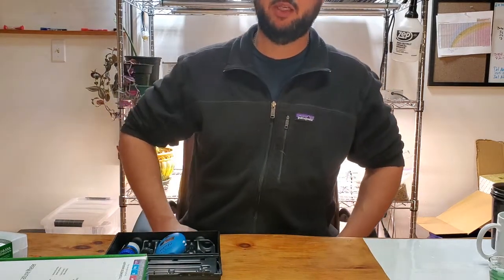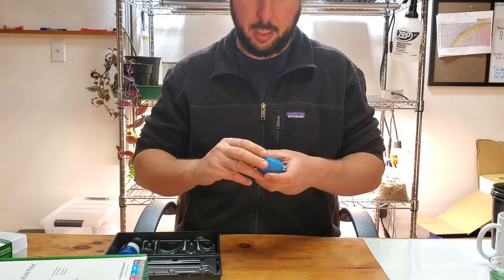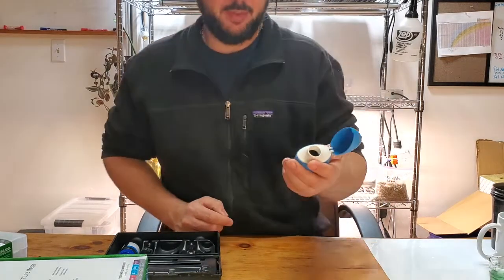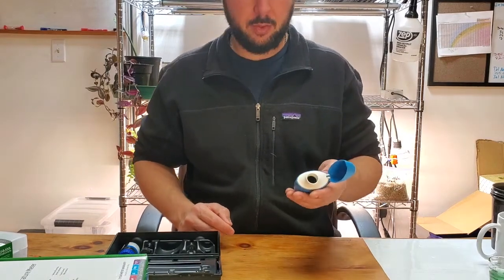Brian Candy here with Sustainable Terrains, looking at some Hanna products. This one is from their aquarium line — it's the Hanna alkalinity checker for checking source water alkalinity.